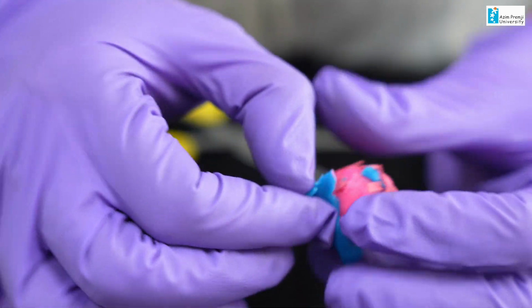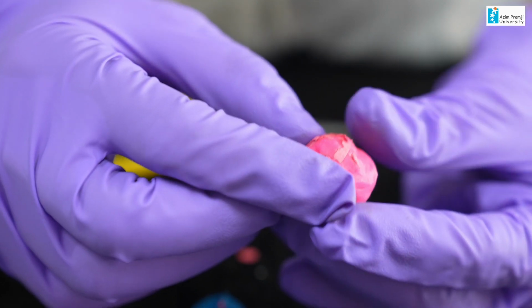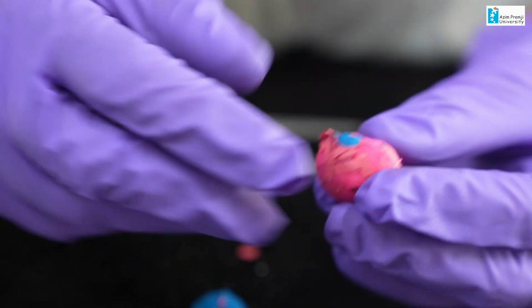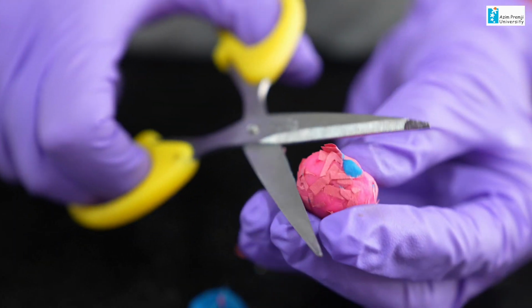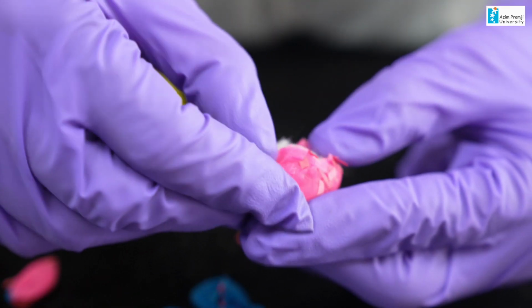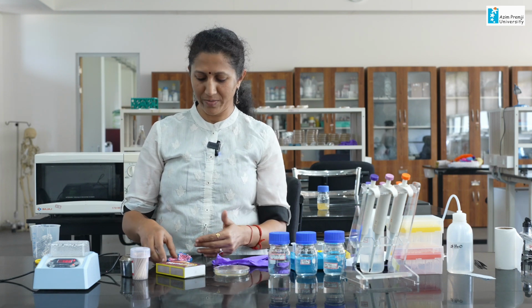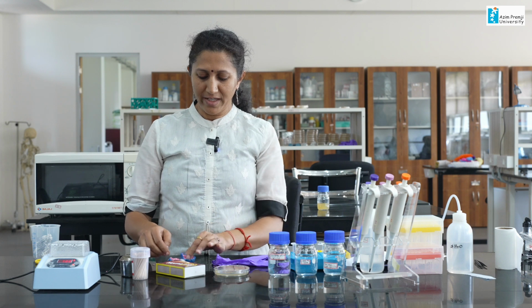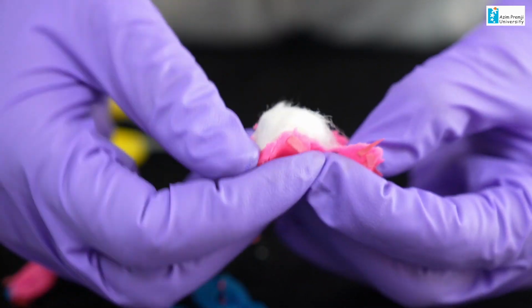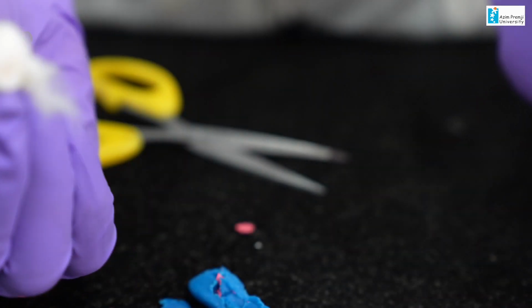Now I am going to break open this nucleus and see what is inside. When I break it open, you can see inside the nucleus there is a white colored thing, which is the DNA. It is not exactly DNA, it is just a model to show where the DNA will be present. Now you have an idea that if I have to isolate DNA from the cell, I have to remove all these unwanted parts and then get the pure DNA.